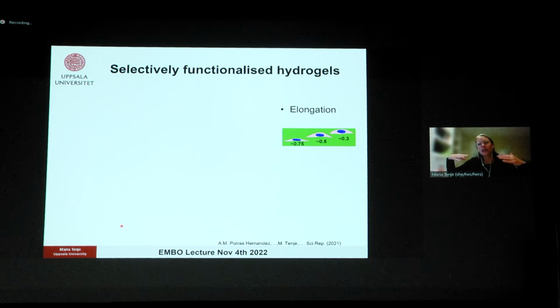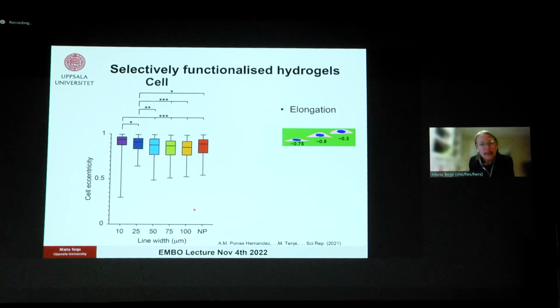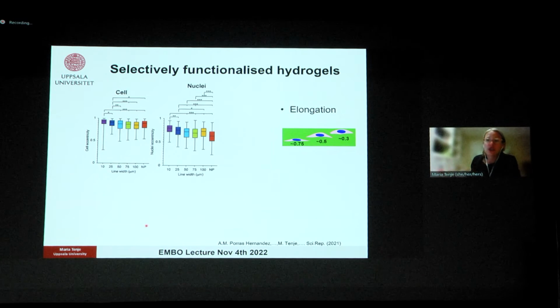We wanted to see, okay, so what happens to the cell structure? And again, looking at the cell body, we can see that as it goes from the non-patterned to the thinner lines, it approaches 1. So it gets more and more flat, i.e. more and more elongated. But it actually becomes more pronounced when we look at the shape of the nucleus, which is much lower in the non-patterned control. And then it approaches 1, or gets more and more flattened out, as the line gets thinner. So the cells are very clearly affected by the fact that they are sitting on a line and they are moving and adhering to this structure.